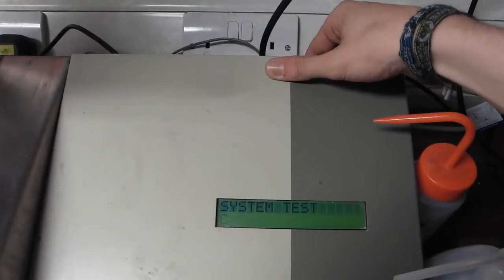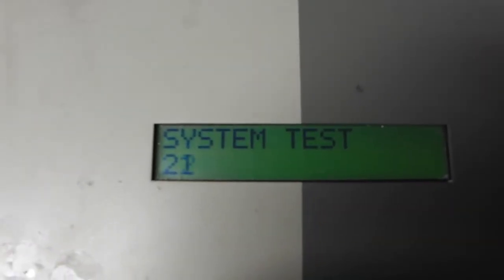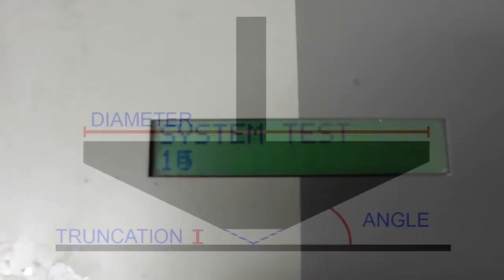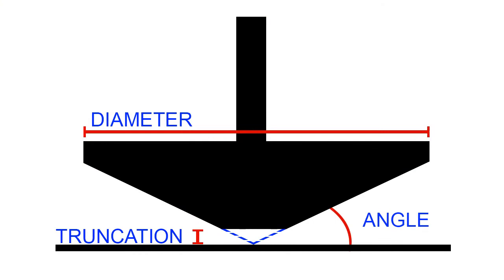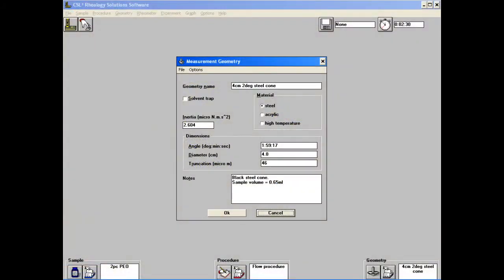Now the instrument is turned on using a switch behind the screen and a system test initiates. The key features of the cone are its diameter, truncation, and cone angle. Their values are printed on the side of the box and should be entered into the software to allow correct calculations.